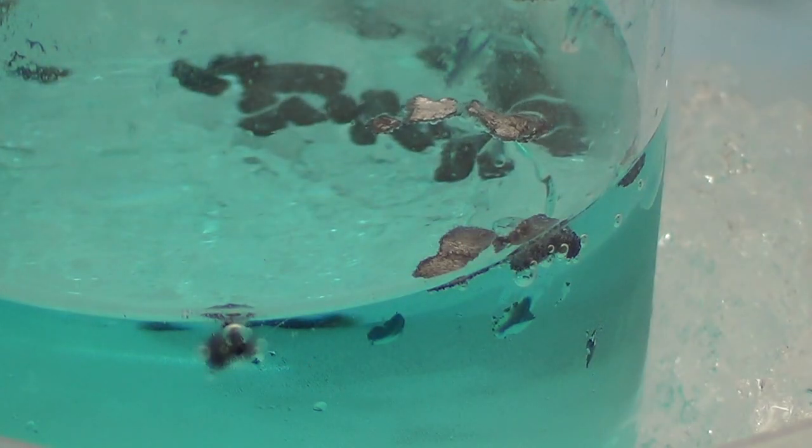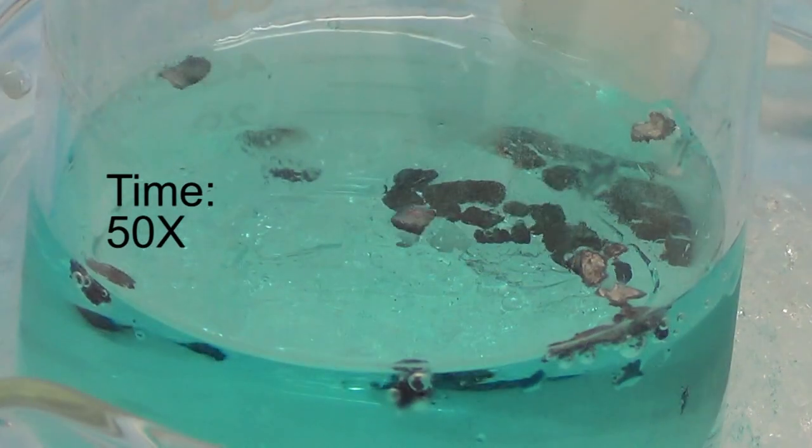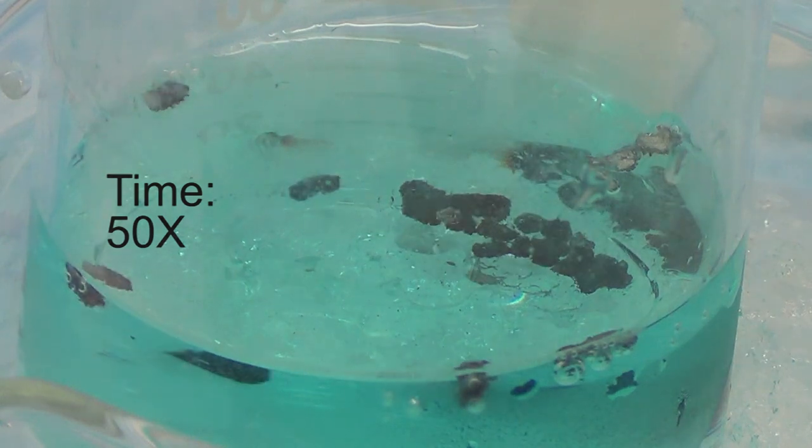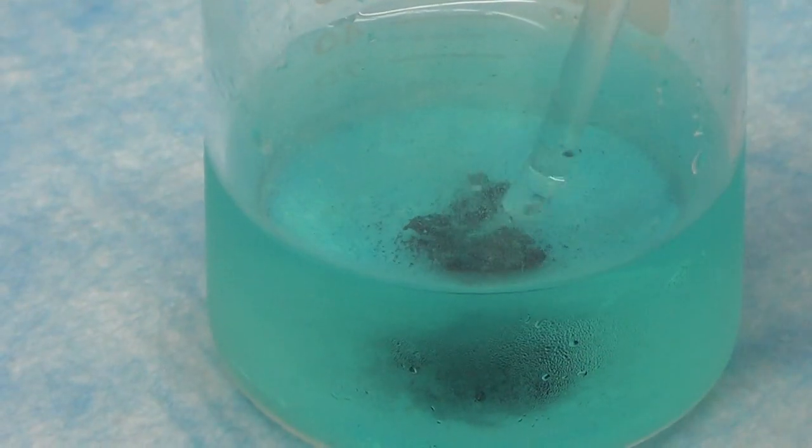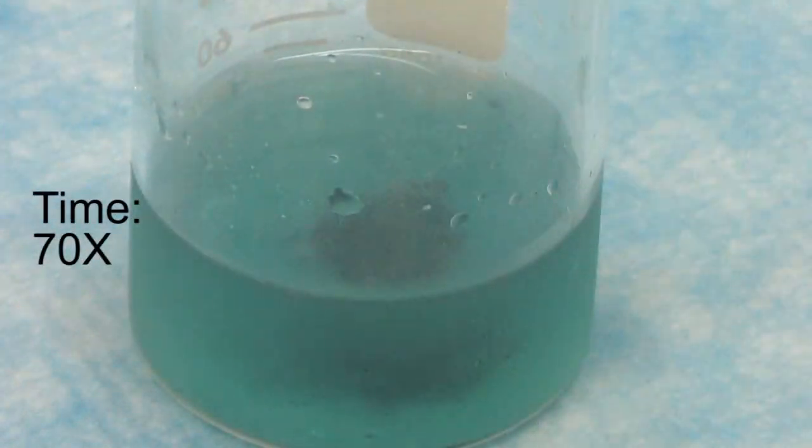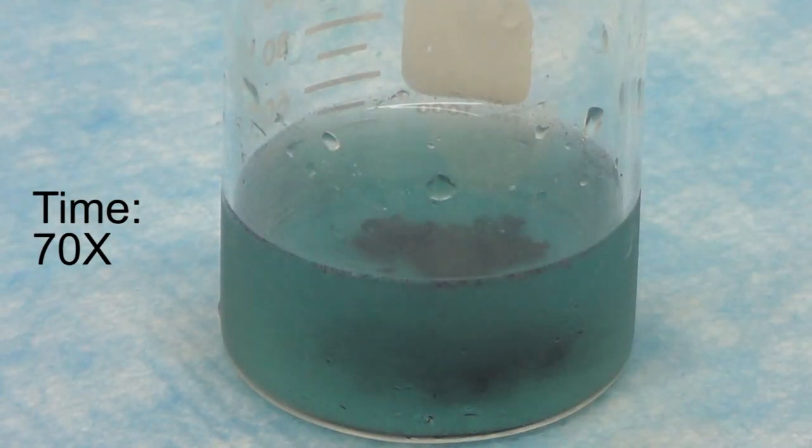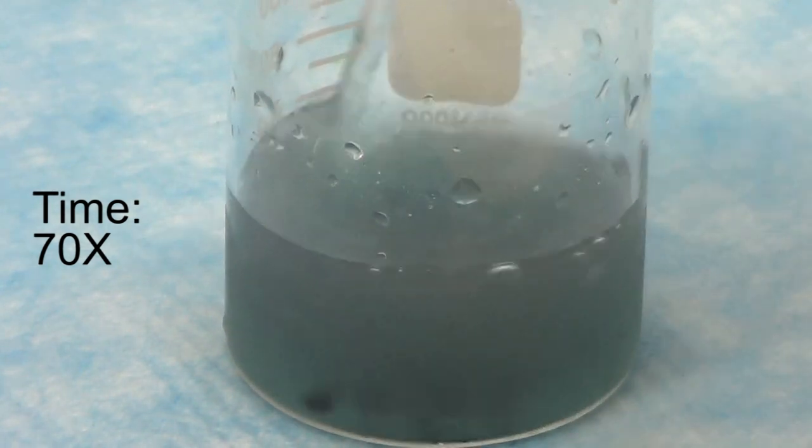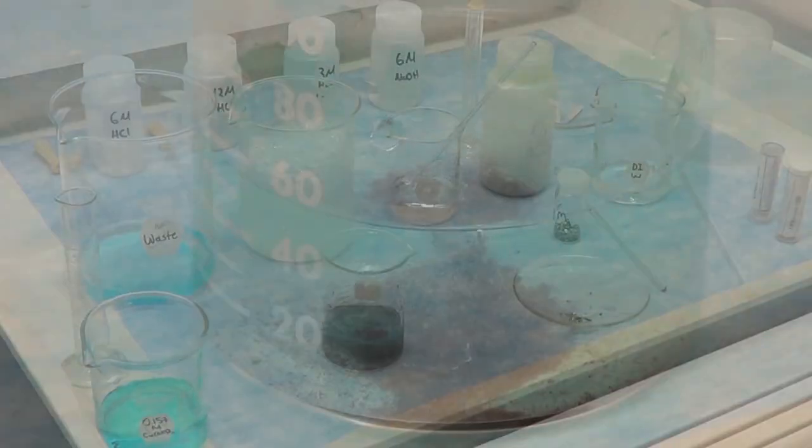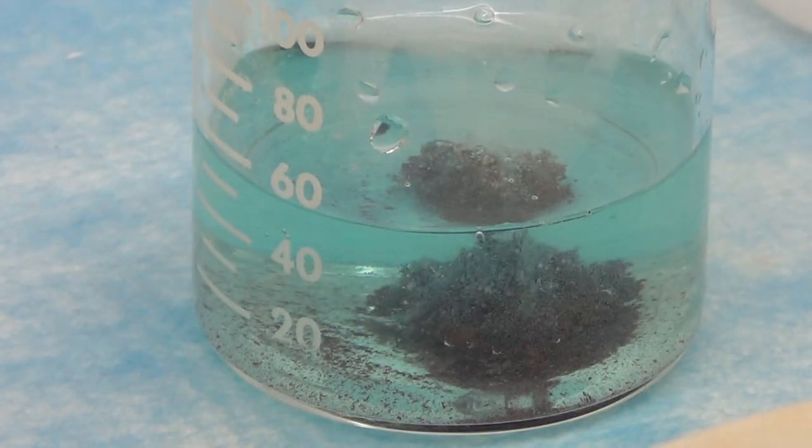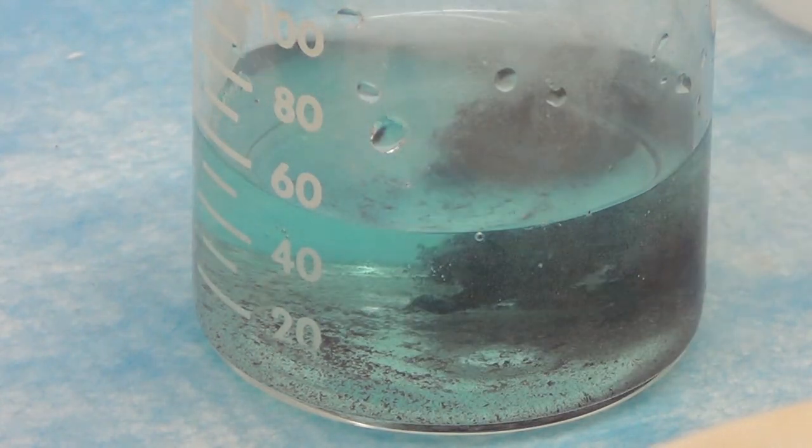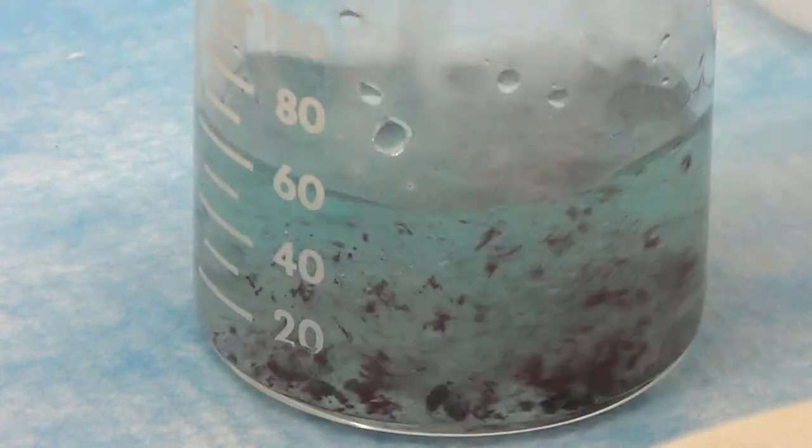This is also an example of oxidation reduction reaction which involves the change in the oxidation number. This is a slow process. To increase the rate of the reaction, we removed it from the ice bath and continuously stirred the solution. The bubbling is due to the magnesium reducing the proton to hydrogen gas.